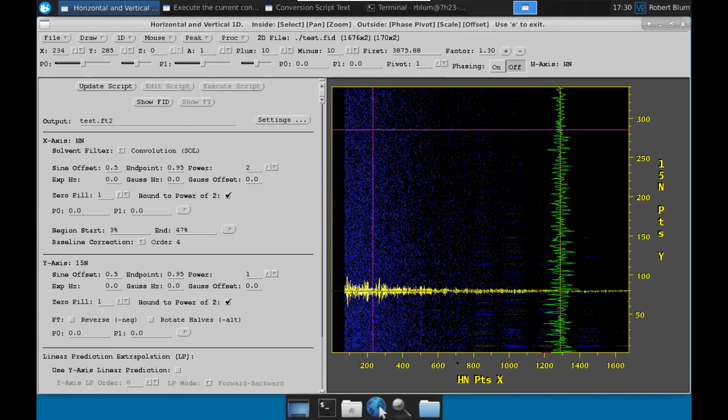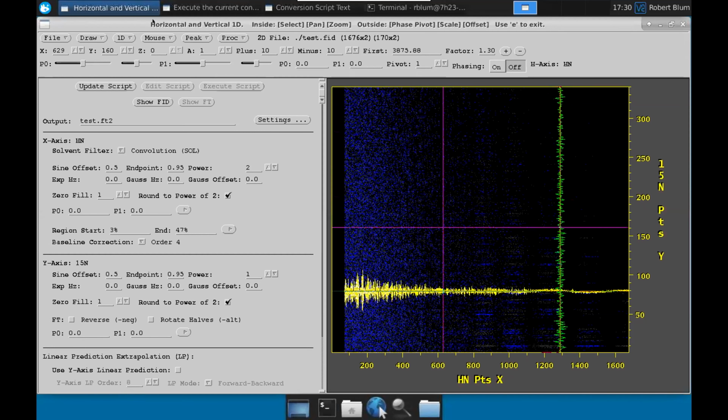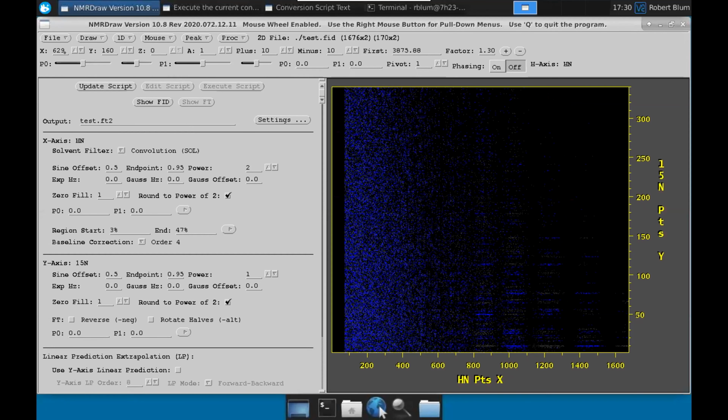And you might notice when you open up one of those menus, like the mouse menu, every command has a one-letter abbreviation. So as an alternative to using the menu, you could just type that command at the screen. One of the most useful ones is that exit command, the one I just did, off the mouse.